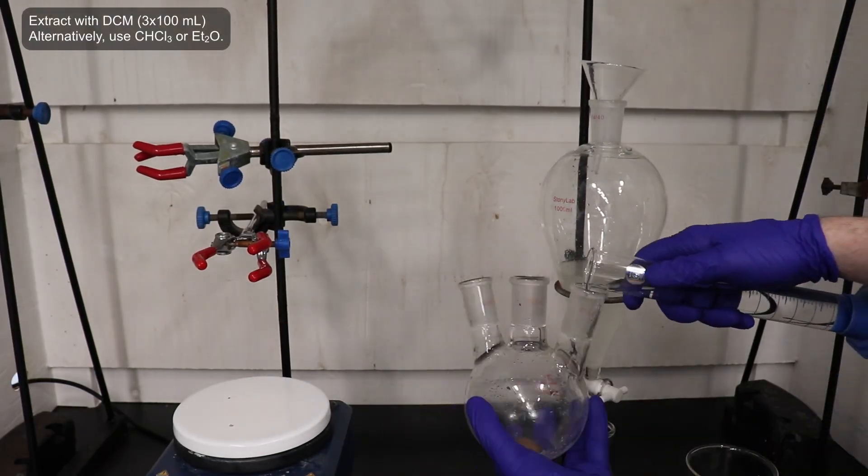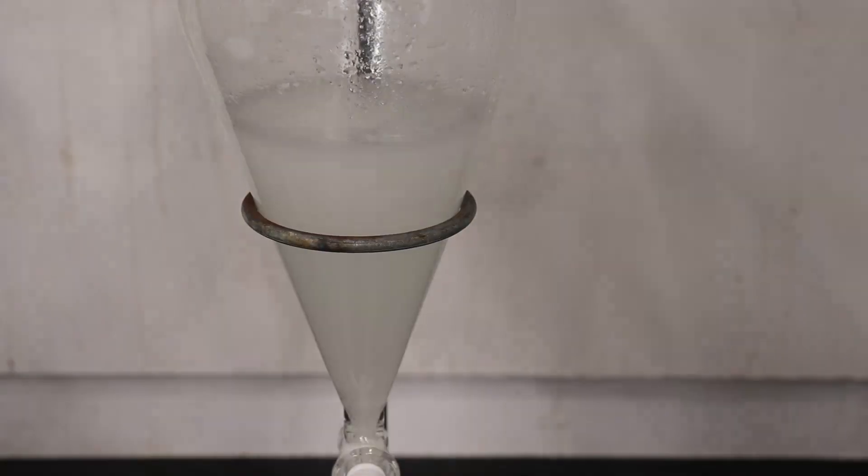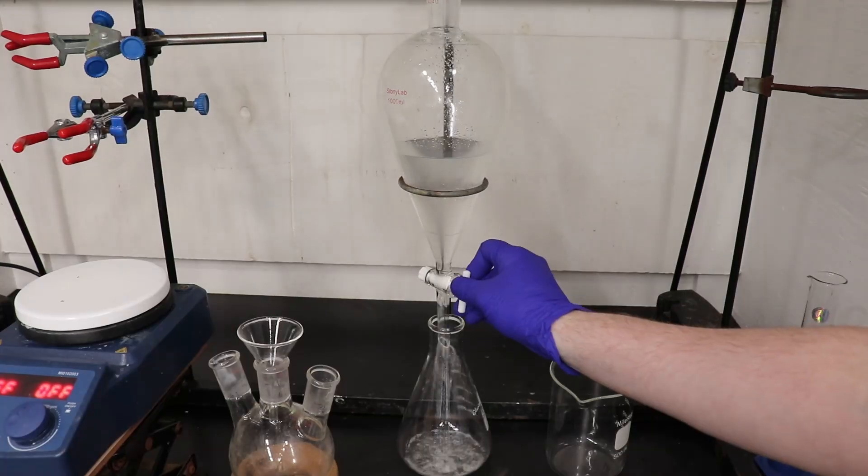To isolate the 2-bromopropanoic acid, I extracted the aqueous phase with 3 100 mL portions of dichloromethane, and alternatively, the DCM could be substituted for diethyl ether or even chloroform.